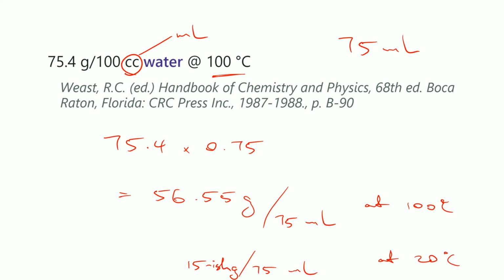Now, the reason why I worked out the solubility at both temperatures, like I'm going to get it boiling, so I could have just worked out the 100 degrees, but I just wanted to check that the solubility at 20 degrees wasn't so great that I won't actually have much salt dropping out. See, what's going to happen is I heat it up so I can dissolve this much salt, but then I'm going to leave it, and it will cool down to room temperature.